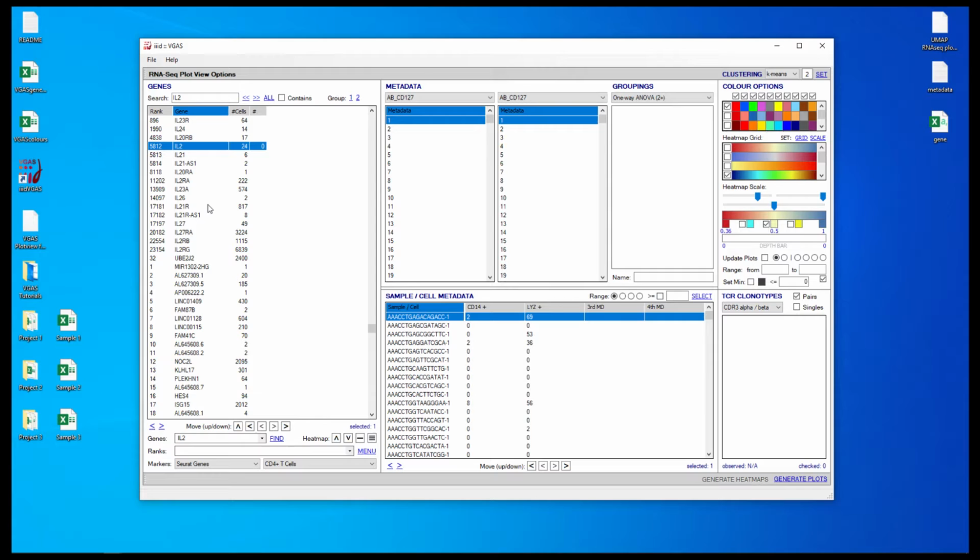VGAS also comes with a set of gene markers that can be used to select and visualize data. These are built into the VGAS Ensemble references file which accompanies the application. New lists of gene markers tailored to the researcher's specific interests can be developed and added to the references Excel file. The default gene markers are included in the Markers menu at the very bottom of the panel.